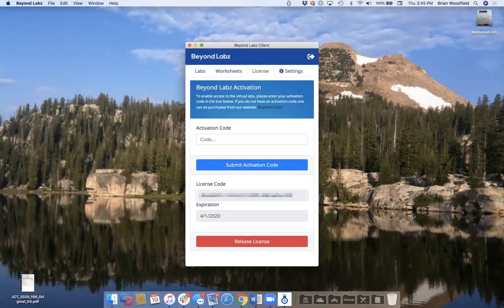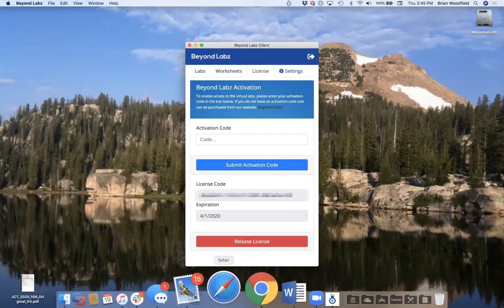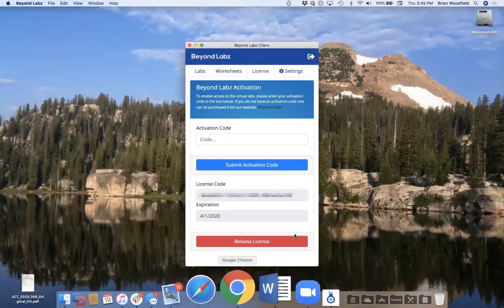They can use whatever your learning management system is, or they can just email. They can send you those lab book files they generate through email or through the LMS. So it's compatible with Blackboard Collaborate teaching? Yes, the lab book files generated within the program can be opened on anybody's computer that has the program.